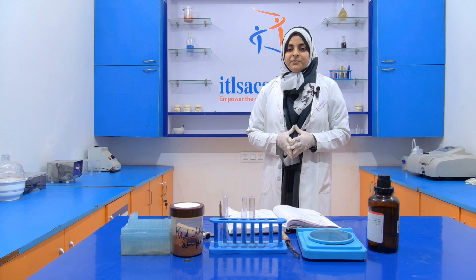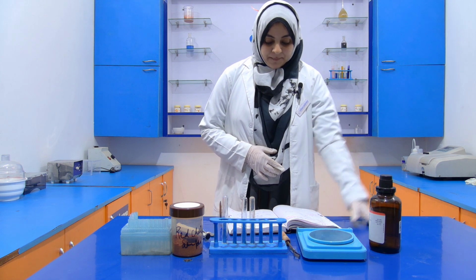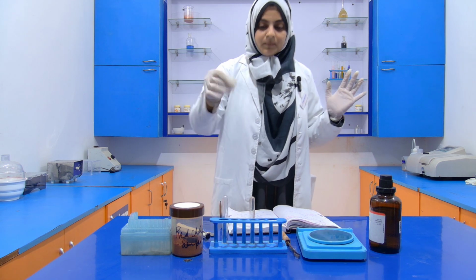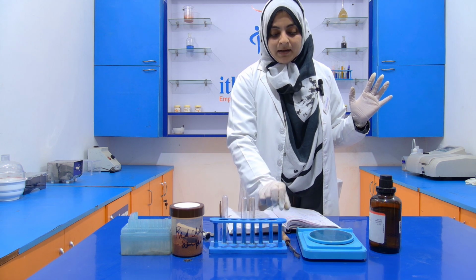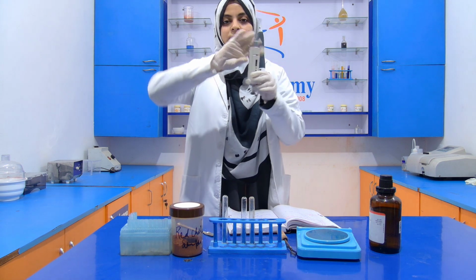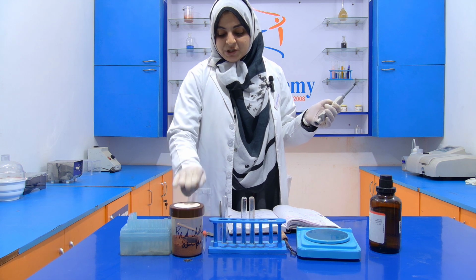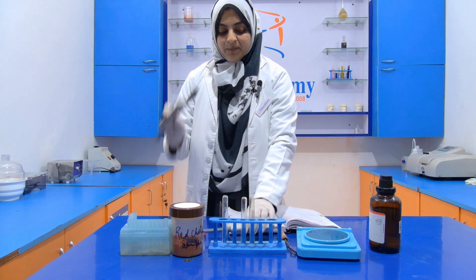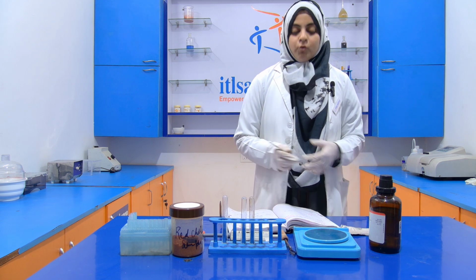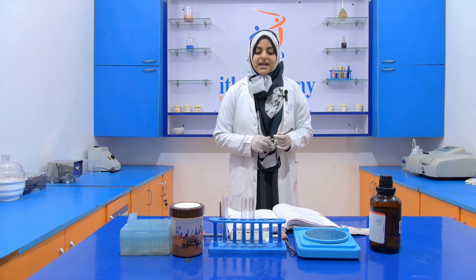Now for performing this experiment, we require one chemical, that is acetone. And we require this setup: weighing balance, test tube, test tube stand, test tube holder, micropipette of 1000 microliter or 1 ml, micropipette tips, dropper, red chili powder, spatula, and aluminum foil. Now what we have to do is take 2 grams of the sample, and to the 2 grams of sample we add 5 ml of this acetone.